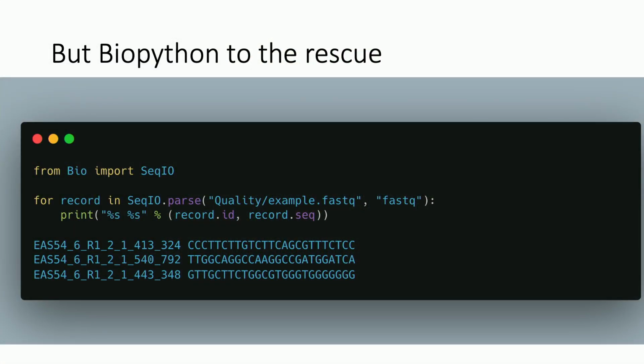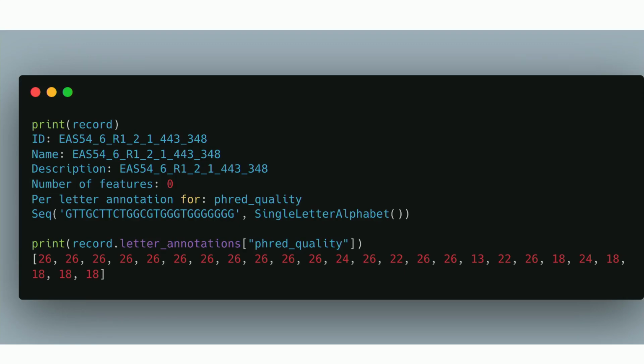The encoding there is a little complicated, so I'll just go through it quickly. As I said, it's the probability that a call is right or wrong. It's called the Phred score, or Q here, and it's the -10 log score of the probability that it was correct. And so what the FASTQ format does is it takes that Phred score and just encodes it as an ASCII value. So the bad characters down there are punctuation, all up to good characters there. Again, BioPython to the rescue. It can read in those file formats, and then you've got an object. You can extract the qualities and the reads if you want. And as you can see here, you can get them in the numerical format, which is what it's intended for.